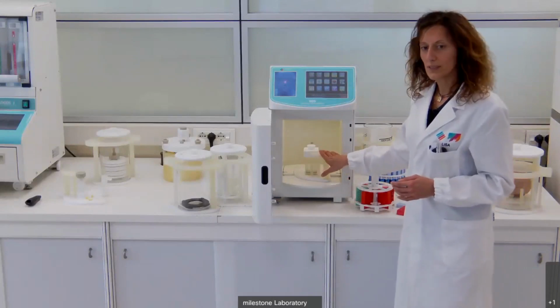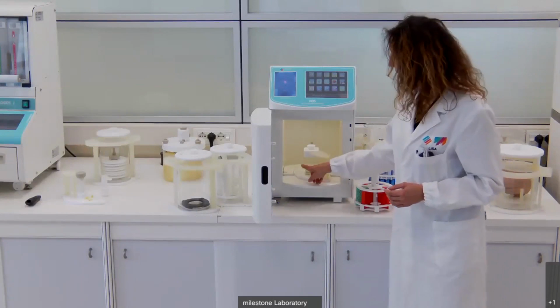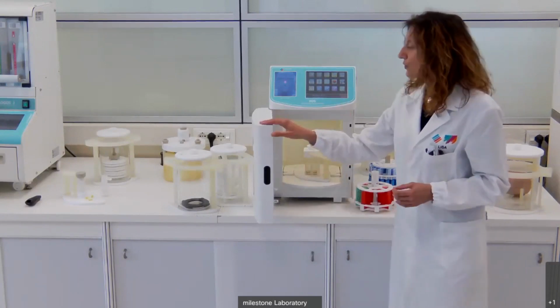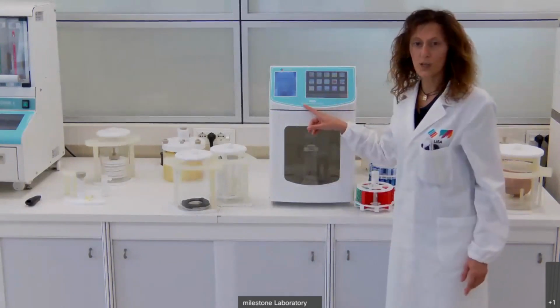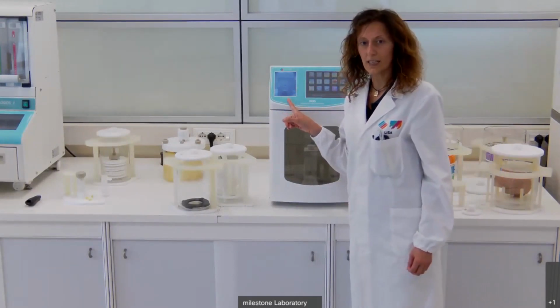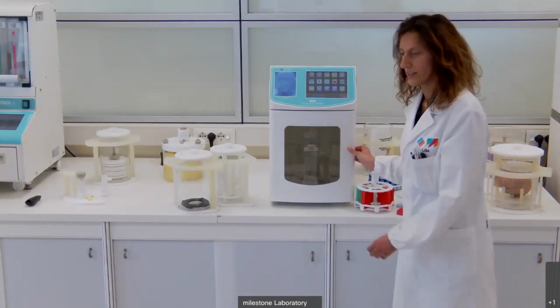This is important to maintain the sample in the correct position and to allow the correct reading of the sensor for the temperature. And also, during the run, it's possible to check what's happening inside of the cavity by watching this camera, this screen. On this screen, you can see what's happening during a run.